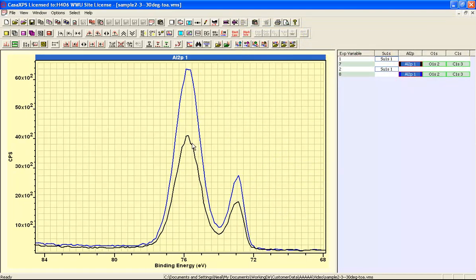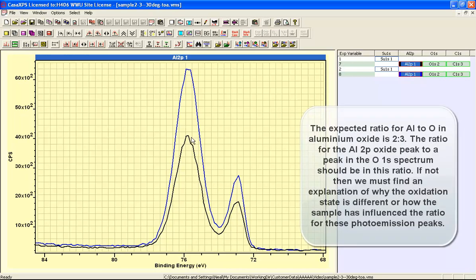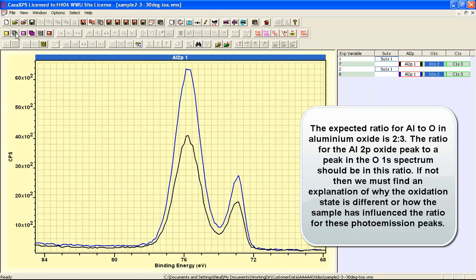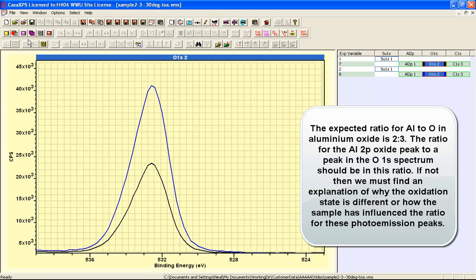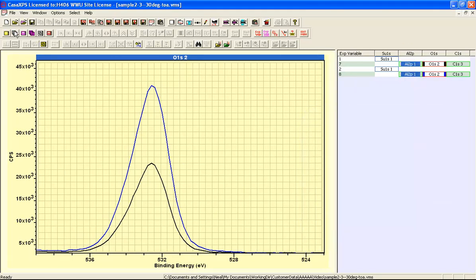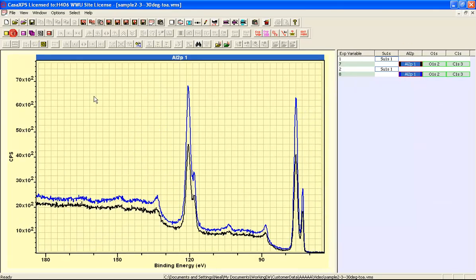The advantage for high-resolution data providing separation of aluminium oxide from the metal means that we can calculate how much aluminium oxide we have, and we should be able to relate how much aluminium oxide from the aluminium 2P to the amount of oxide that we calculate from the oxygen 1S. So the intensity of these peaks from the oxygen should correlate with the intensity of these oxide peaks that we see in the aluminium.